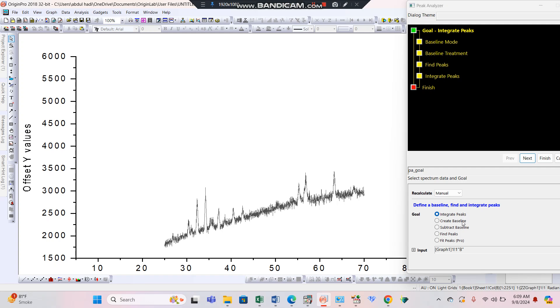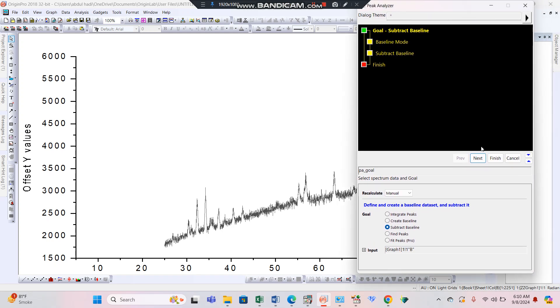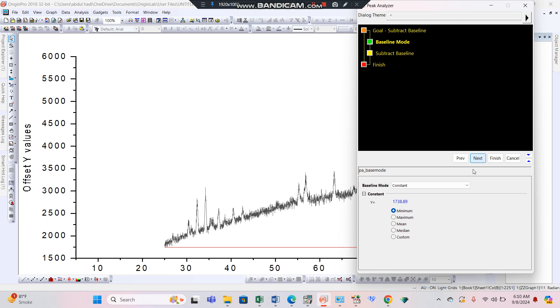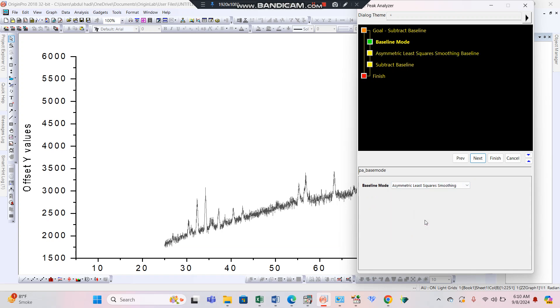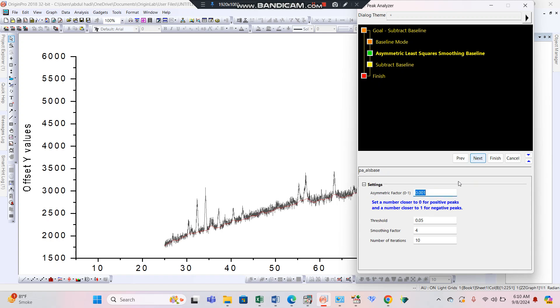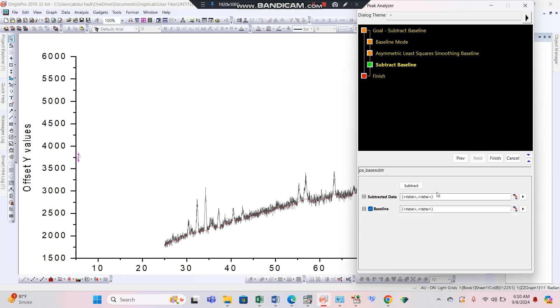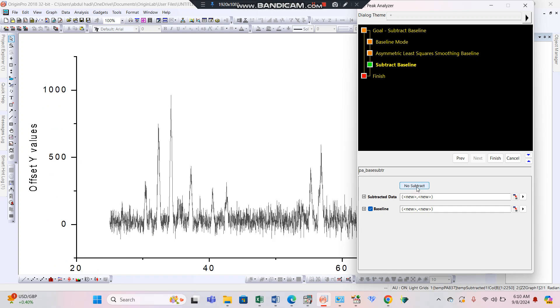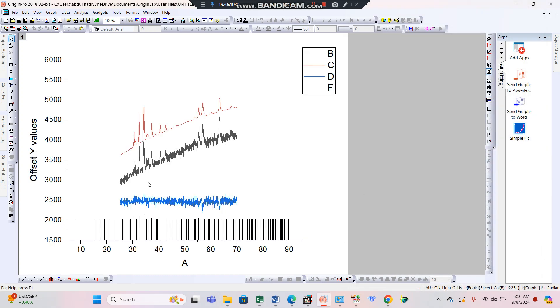In the peak analyzer, open the dialogue box. Choose subtract baseline and press the Next button. Here, choose asymmetric least squares, then press Next, Next, and Next again. Then press subtract — the graph baseline becomes straight. Finish this process. You can see the baseline of this graph is now set straight.